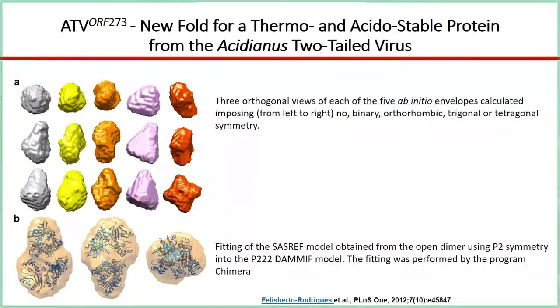They were looking at different kinds of dimers, open and closed conformation dimers, whereas under purification conditions, which was slightly different pH, they were finding that it was a tetramer. And in the crystallization conditions, the dimers, the open and closed conformation dimers, showed a propensity to form fibers, long fibers, which one could suspect is what is leading to the tail formation, right? They could be an important component in the viral tail formation.